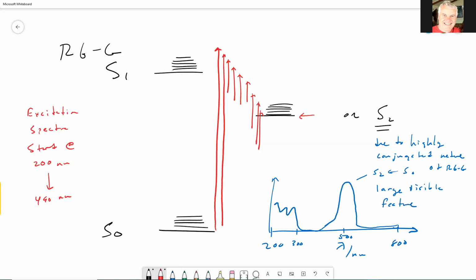Actually, I think we can probably go to 590 actually. And then we're gonna get all the way pretty much to the bottom of this well here. Okay. And all these arrows come down all the way to the base here. I just haven't drawn them in quite perfectly, right?